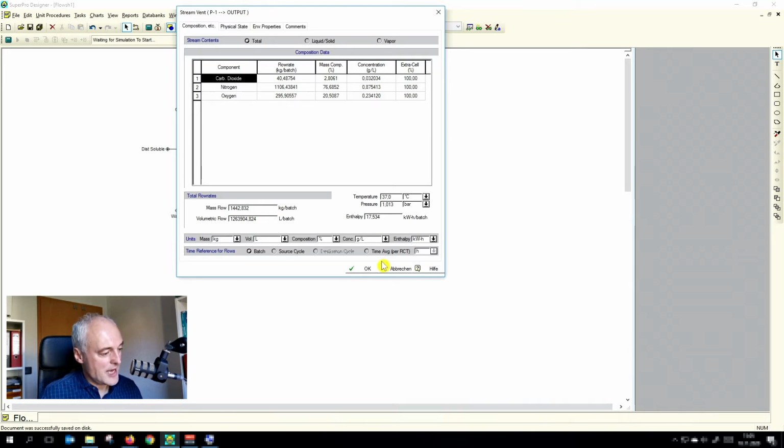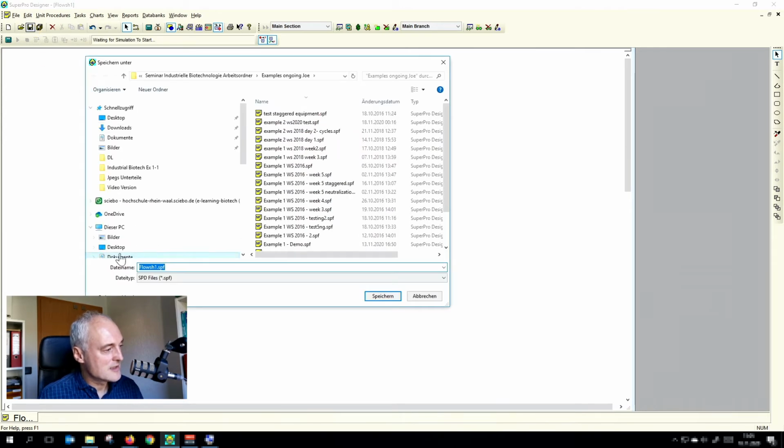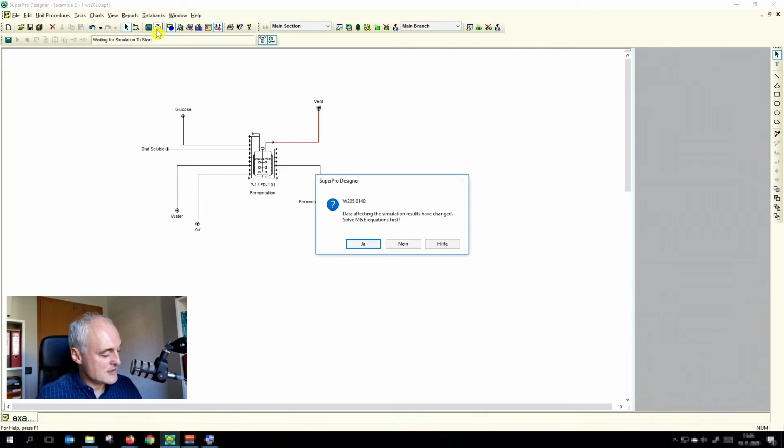Now with this, we are happy. And now we also display the economic evaluation report. And this only works if you have saved it. So this is already a good time to save. And okay, now we do the economic analysis.